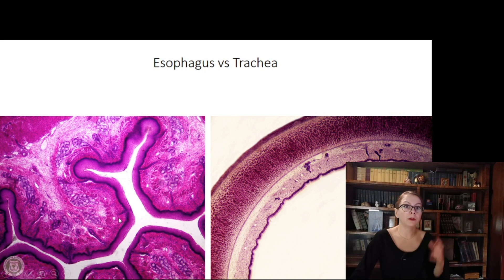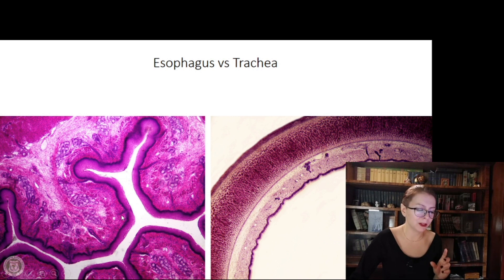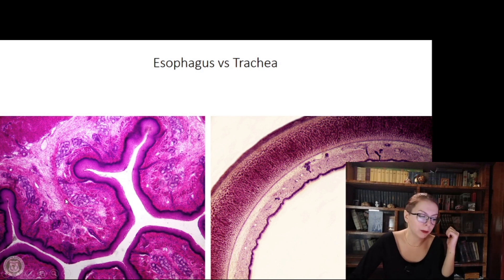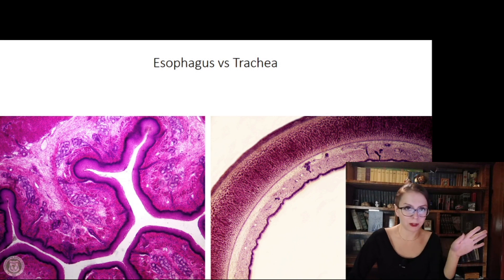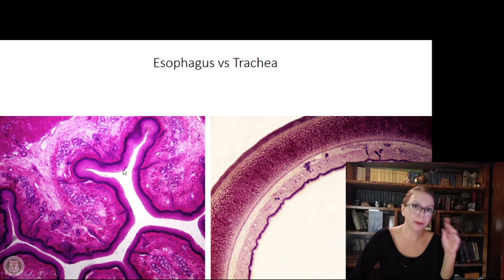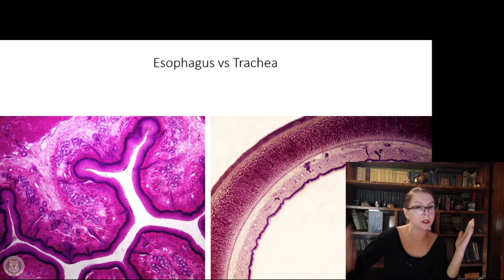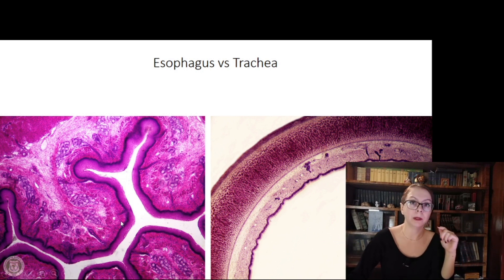Under the epithelium there is the lamina propria made of loose connective tissue where cardiac glands might be found in the esophagus, though they may not be present in all specimens. After that, the muscularis mucosae and the submucosa follow. In the submucosa, proper esophageal glands are present and well developed — almost always visible in student specimens. Remember: cardiac glands are located in the lamina propria, while proper esophageal glands are in the submucosa.